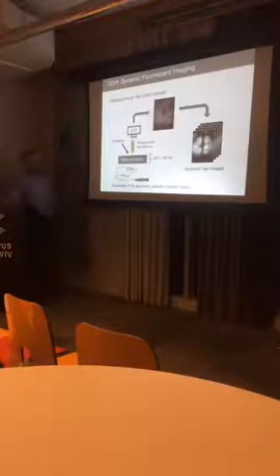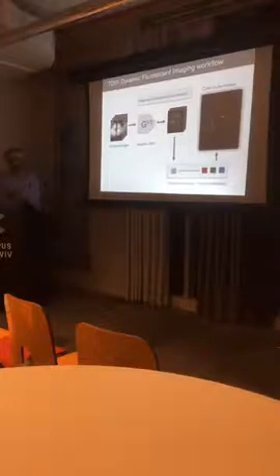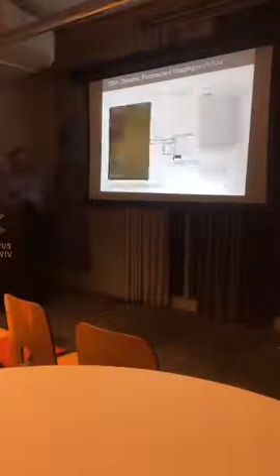After that, we use some filtering, adaptive filtering, and then recover the information based on the time indexation. The colors mean when the material appears. Okay, let me show you here.